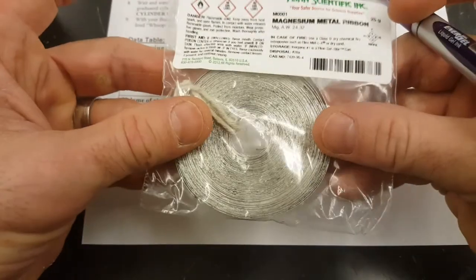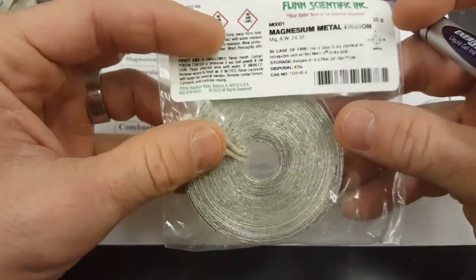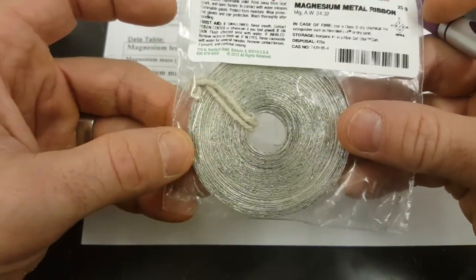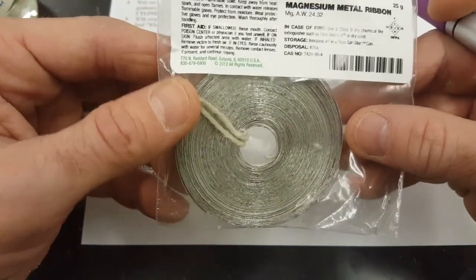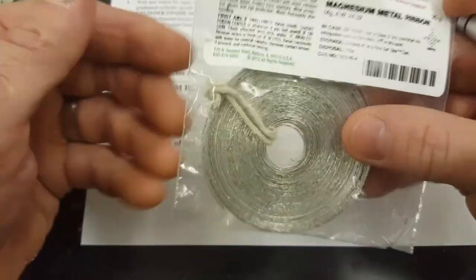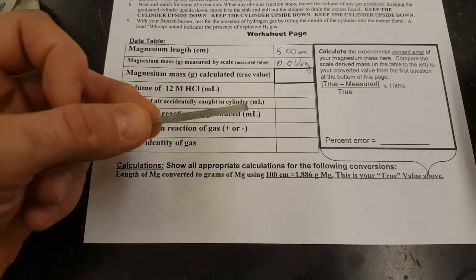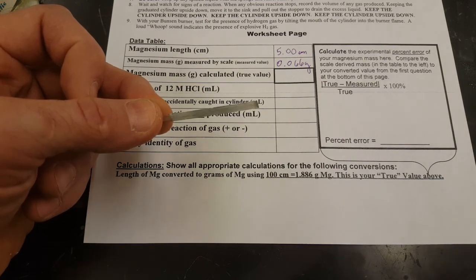All of the magnesium comes in these coils, and their masses per 100 centimeters we find by cutting a few different 100.00 centimeter lengths and then putting that coil on a scale. And from that ratio, we can compare a calculated mass to the scale mass and find out, well, how wrong is our scale?